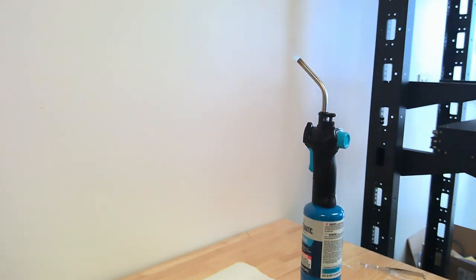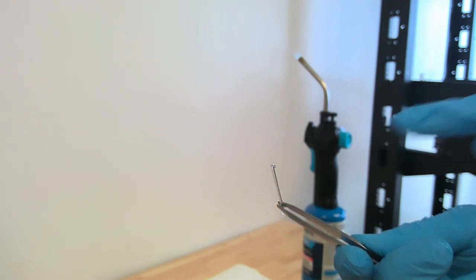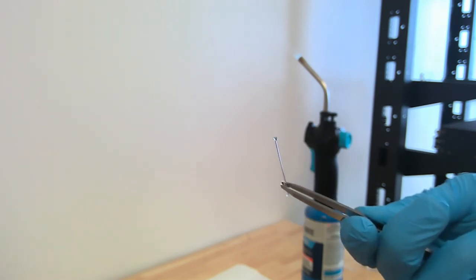So if you've done this properly under vacuum, both ends should be completely sealed. And if it's sealed under vacuum, the inner contents of our melting point capillary tube will be completely evacuated. We won't have any oxygen present inside our melting point tube, which will allow us to measure the melting point of substances that are sensitive to decomposition.